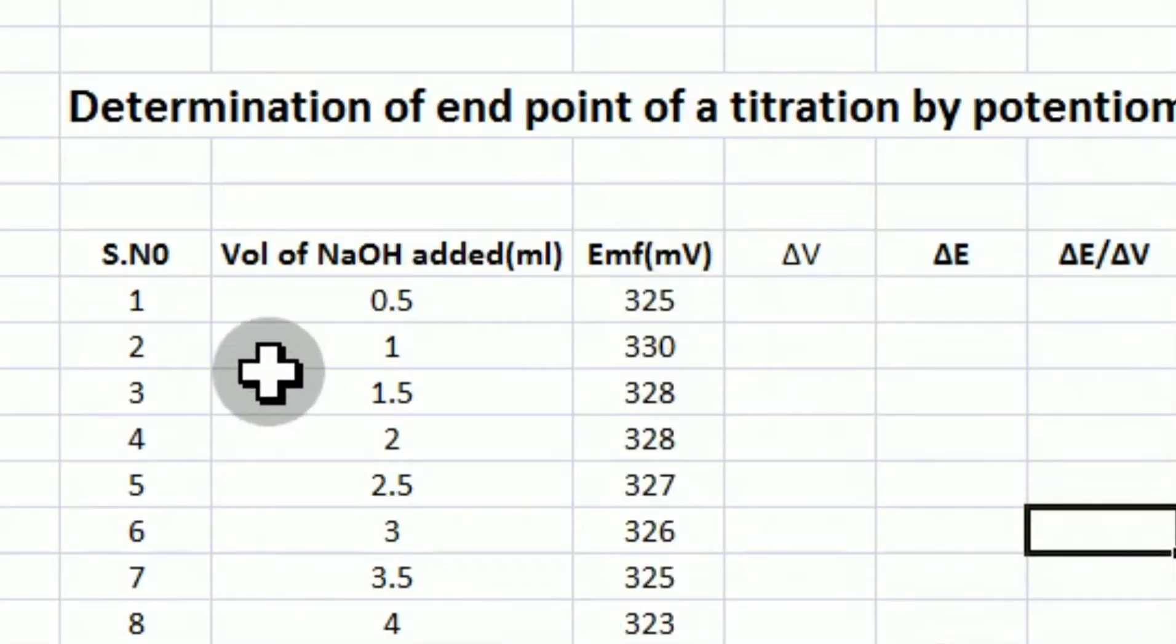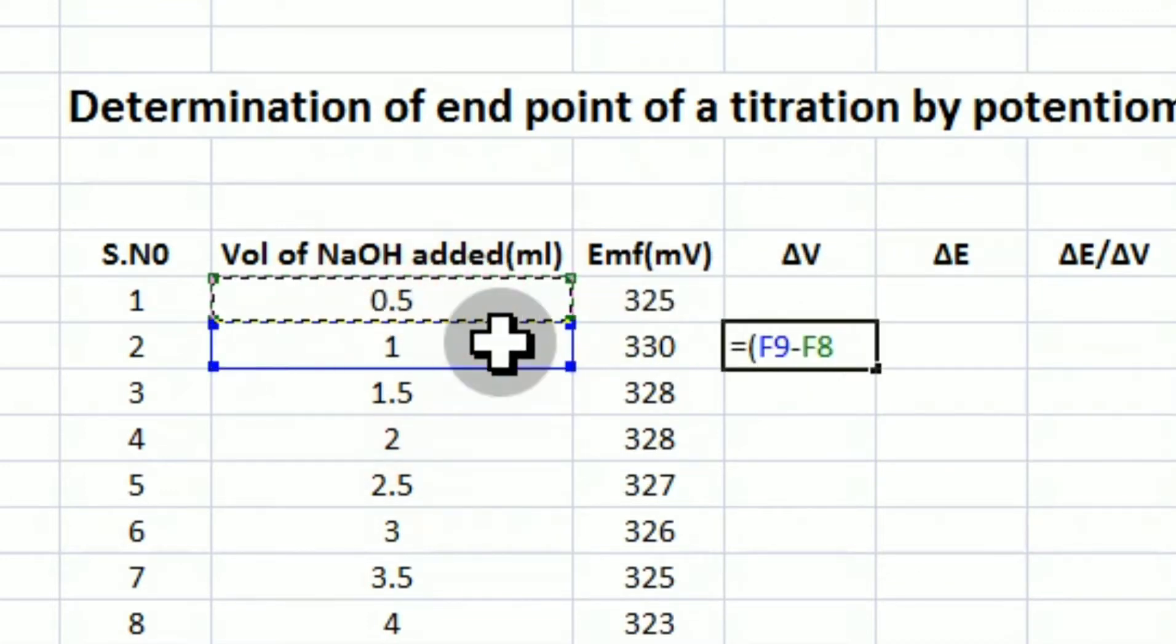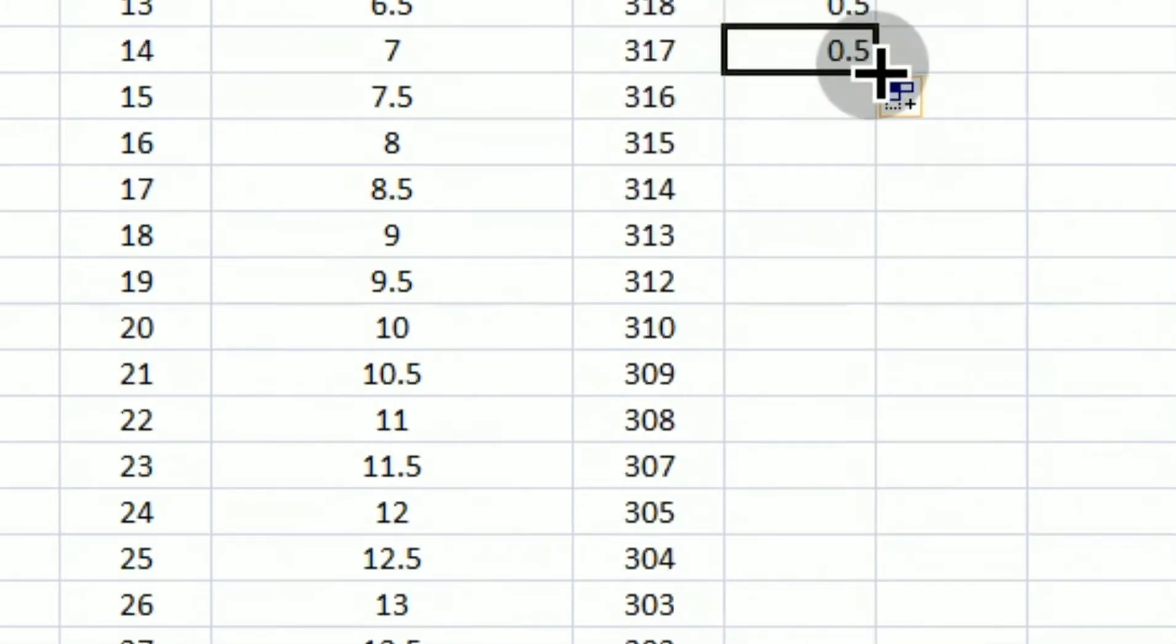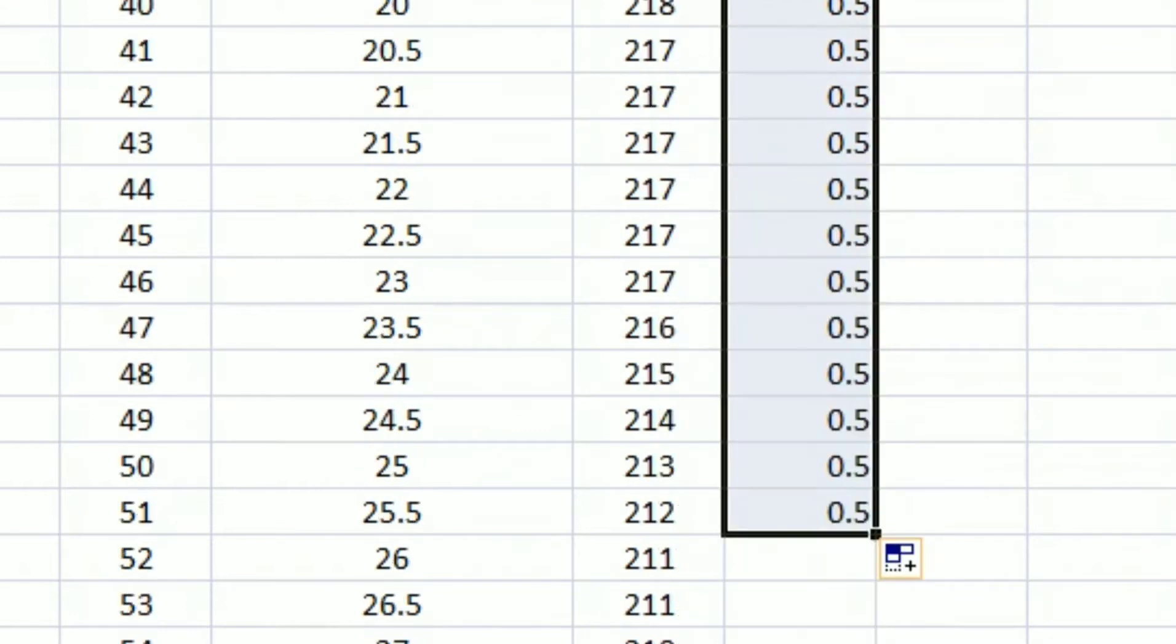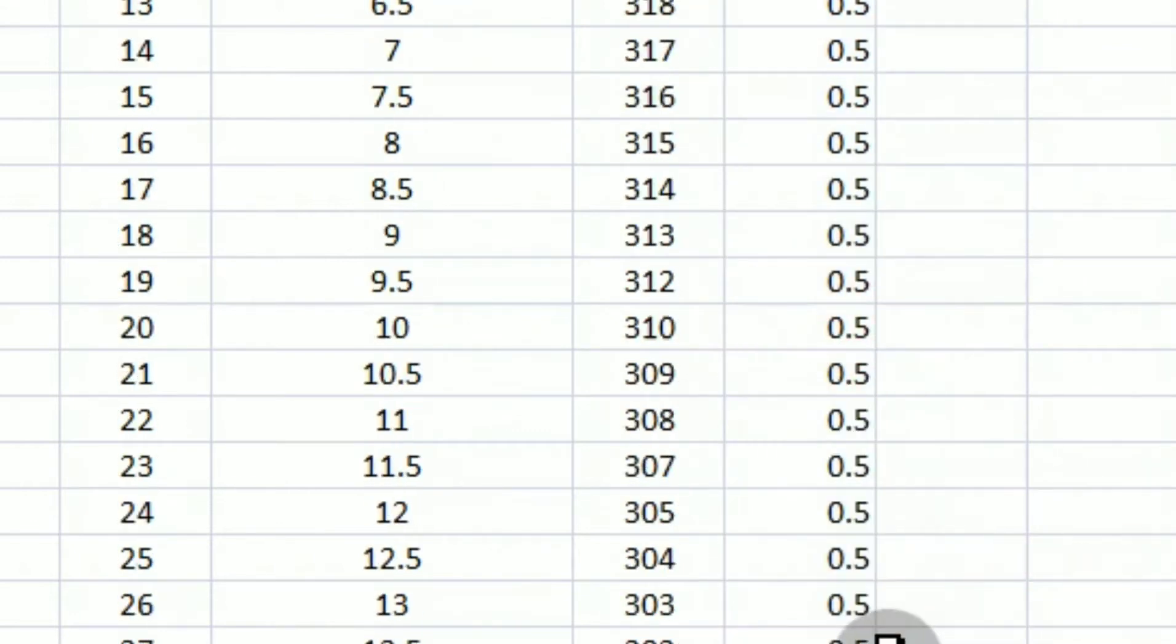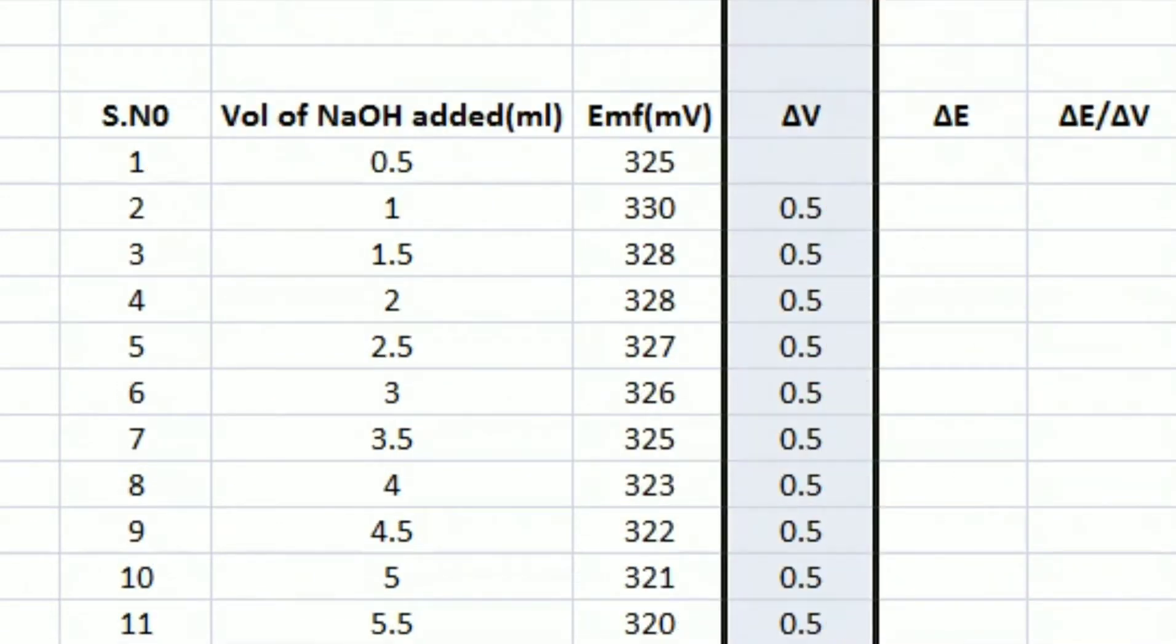So now you enter the volume of sodium hydroxide added and the potential that you have noted into an Excel sheet. Also in the Excel sheet, we have to calculate the delta V value. That is the difference in the volumes or the successive volumes. That is, it's always a 0.5 ml because every time we have added 0.5 ml to this hydrochloric acid solution.